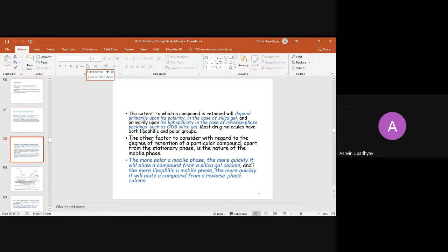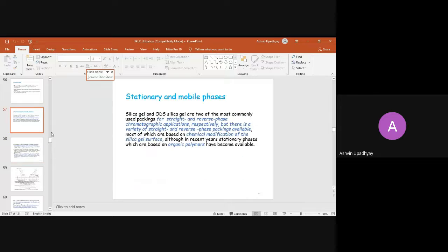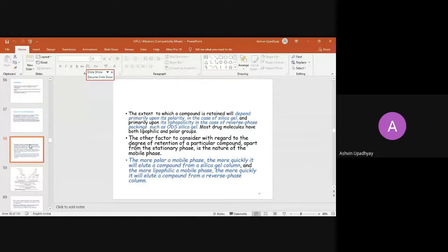Now we are discussing the HPLC utilization for drug discovery. So, more polar mobile phase, this is the basics of how to extend the HPLC utilization for your final drug analysis. Unless you know this type of entity, you may have several problems, several questions related to your analyte.